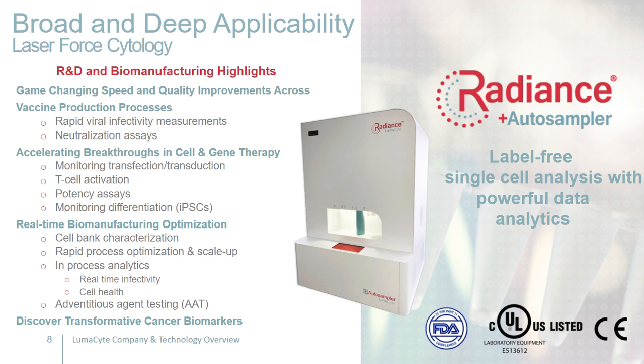In terms of biomanufacturing optimization, right, it's useful from the very beginning with cell bank characterization, understanding the number of passages and having a quantitative tool to characterize that. Rapid process optimization and scale up, looking at infectivity and understanding that optimization, being able to do that much faster than before. Being able to analyze in-process samples.